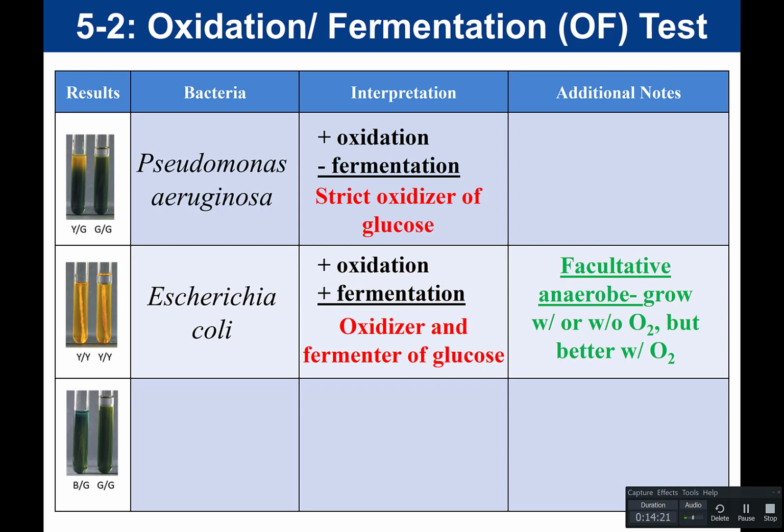So they can grow under either condition. However, they will grow better if O2 is available. So for these organisms like E. coli that can do both, they will grow better when O2 is available.